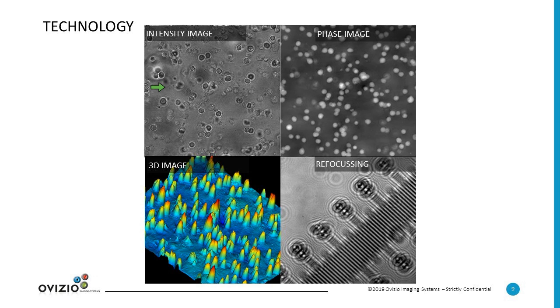This image allows us to see and identify some features and characteristics of a cell, but of course not so many, as we are completely label free and we are not using any stains or reagents. We do not touch anything of the cell. The bright field image does not provide us with a lot of information. We get a lot more information from the phase contrast image and of course from the 3D holographic image.